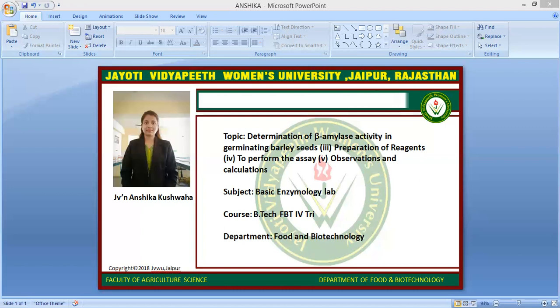This completes the enzyme activity measurement. Both Benedict's reagent tubes are placed in a water bath at 80 degrees Celsius for 10 minutes and then examined for the presence of cuprous oxide precipitate. All data is then recorded for further investigation.